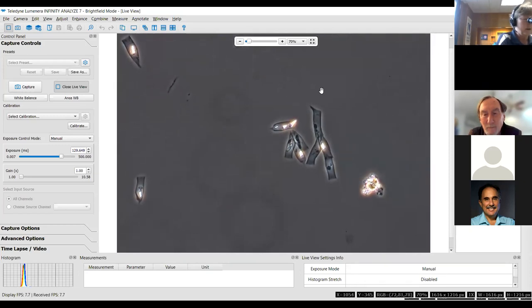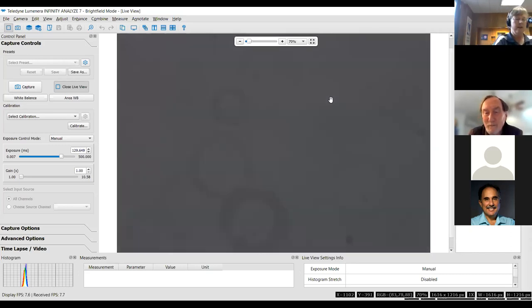There is also a species of Phanocapsa that specifically blooms in empty Dinobryon lorica. And it's Phanocapsa parasitica. It's great fun to find because it always is down here at the end of the lorica. And they're a lot of fun to find. Yeah, I just saw something the other day. It's very cool. Oh yeah, I love finding that stuff.